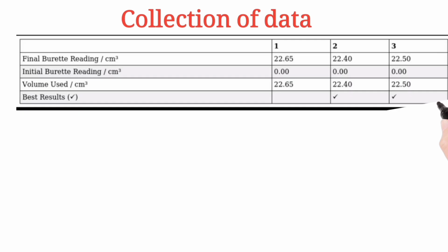And then the third titration, we ended at 22.50 cm cube. We assume that those are assumed values. It might be the same for me and then different for another person depending on the masses we are using. Let's assume that this is one of the data we collected in the laboratory.